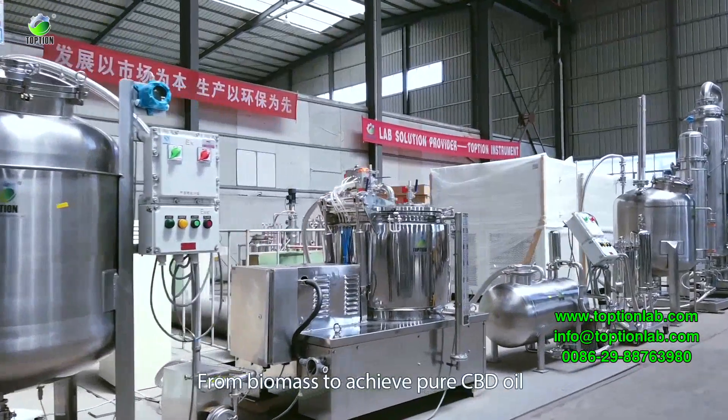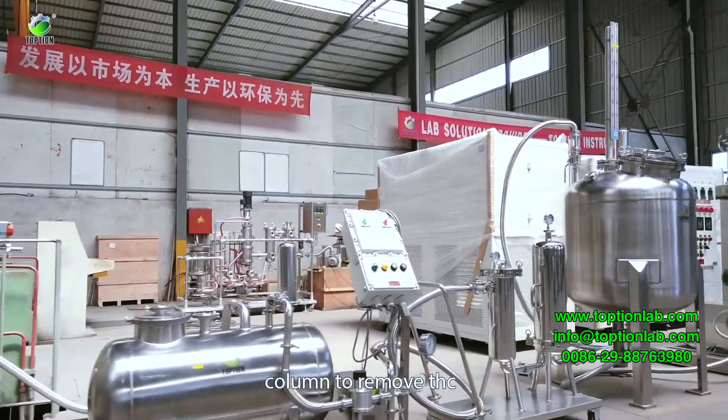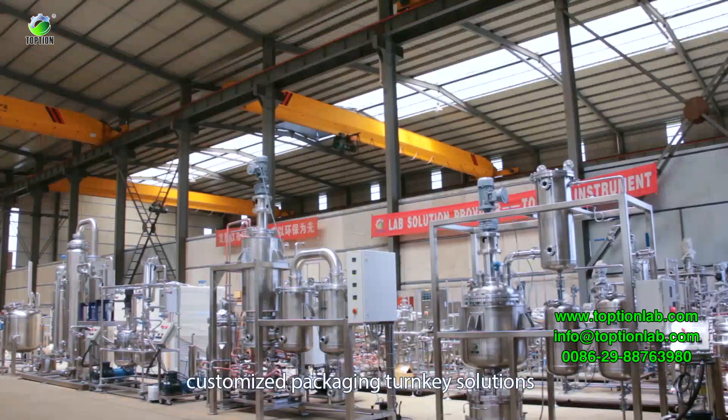The full process takes biomass through to pure CBD oil. Additional steps include crystal drying, a column to remove THC, and customized packaging turnkey solutions.